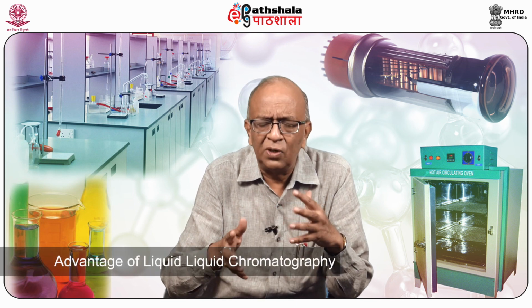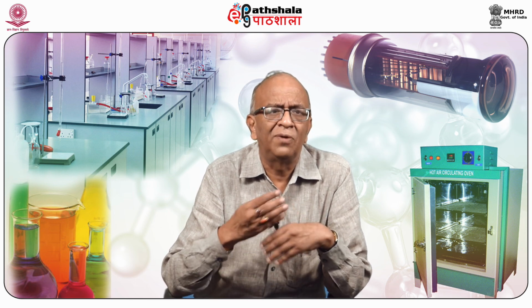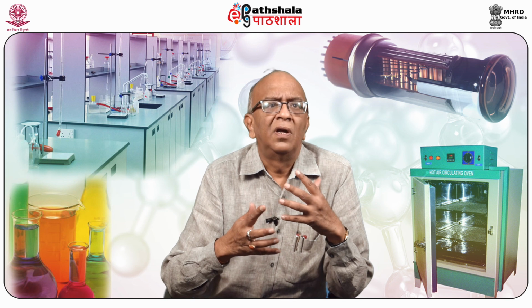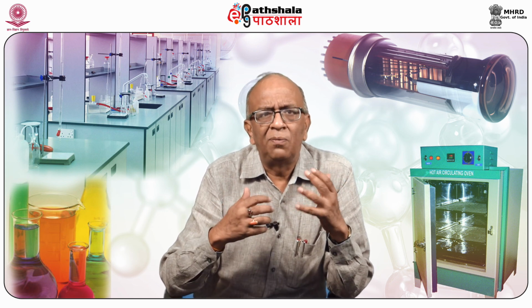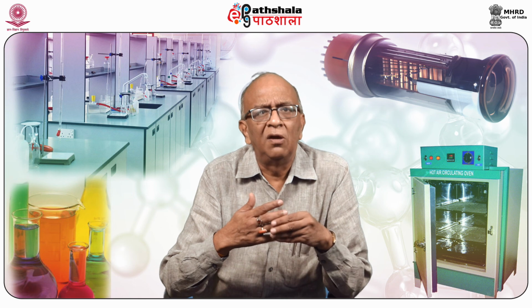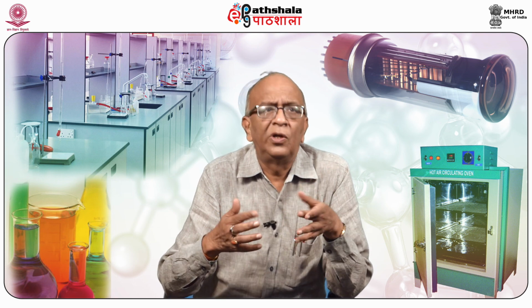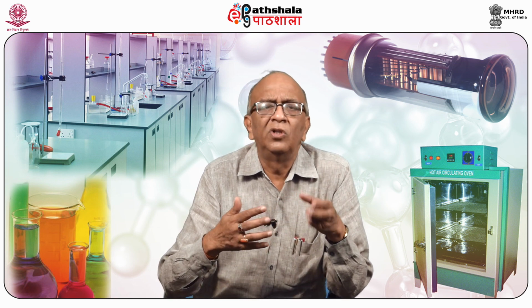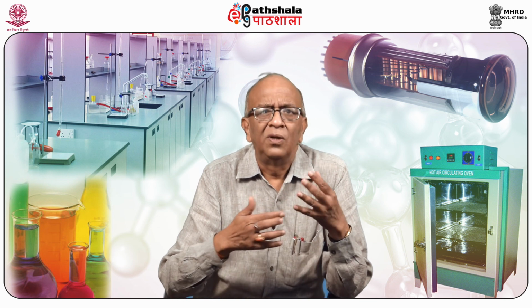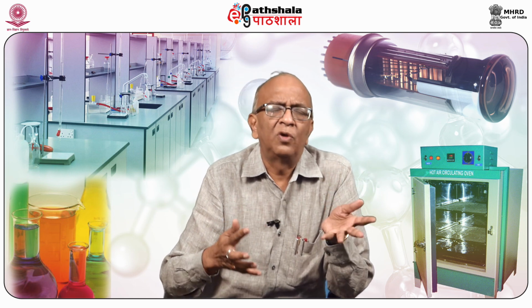And another advantage of liquid-liquid chromatography, as you have seen in the case of high performance liquid chromatography, is that here we can study substances which are not thermally stable. Many substances like different types of proteins and body fluids are not thermally stable, so we cannot heat them. They can be easily separated by high performance liquid chromatography, but not by gas-liquid chromatography, because at high temperature proteins will coagulate and their nature will change. So high performance liquid chromatography is superior to gas-liquid chromatography in that case.